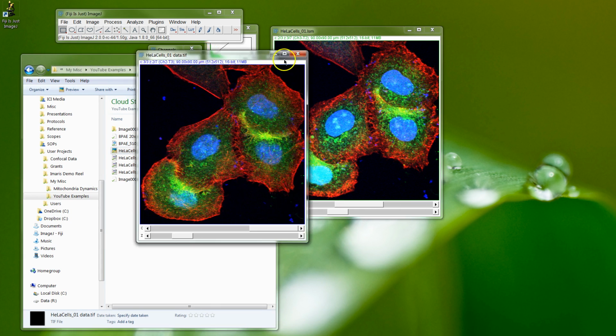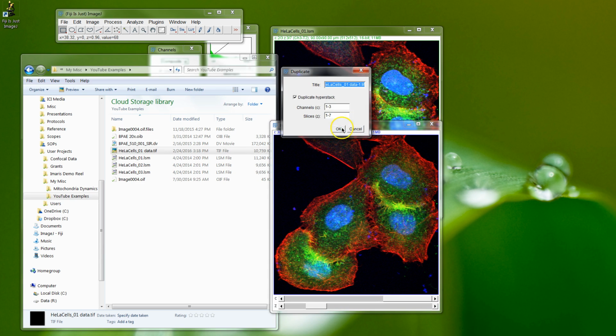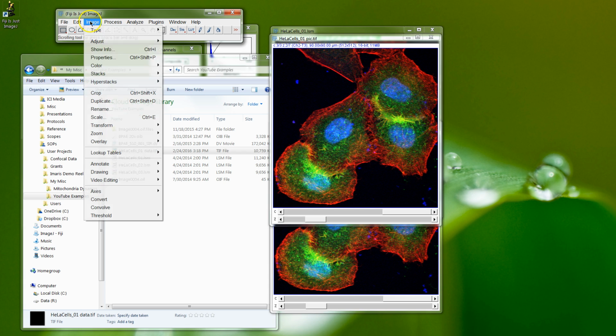So the viewing of a data format TIFF isn't always straightforward. So let's take this, our data TIFF. I'm going to duplicate it again, and we'll call this next one, you can change the name as you duplicate, we'll call this a picture TIFF. Let's go ahead and do that. But what we need to do is change it to a type of RGB color.